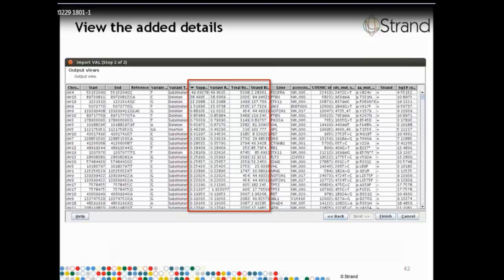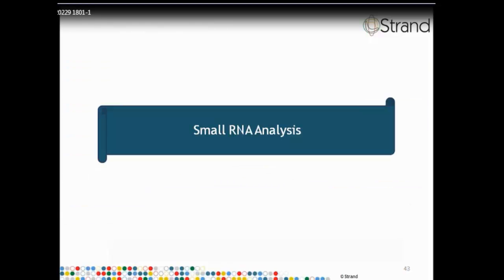So in other words, we have seen in just 2 clicks how to verify that there was exactly one SNP of all the 769 variants mentioned in this panel in this particular sample. So this is the way in which a typical sample could be processed. You would have the Ion panel, and you would simply import the Ion panel and the patient sample. You would take a look at this list, you would sort on supporting reads and see how many of the rows have high supporting read percentages and low strand biases. We spent a lot of time on amplicon analysis. We'll take a brief look at some of the other analysis present in the tool.